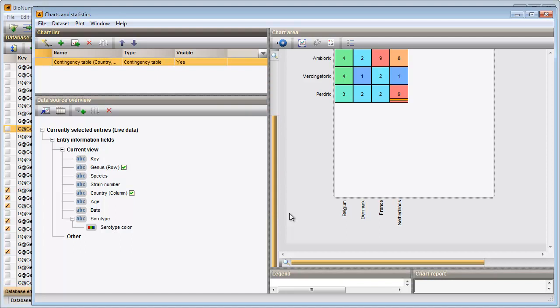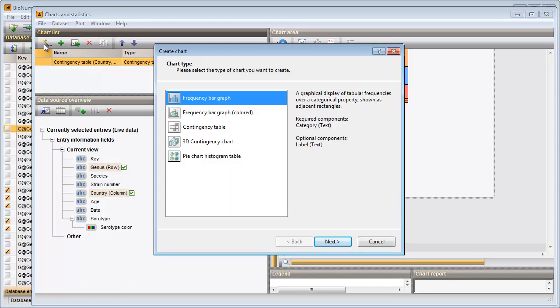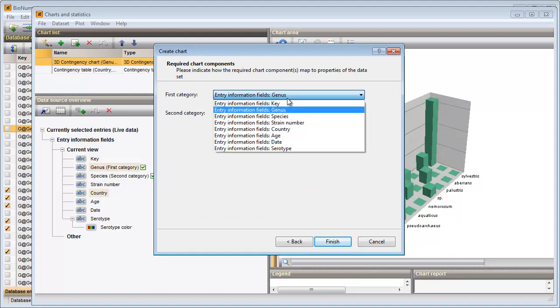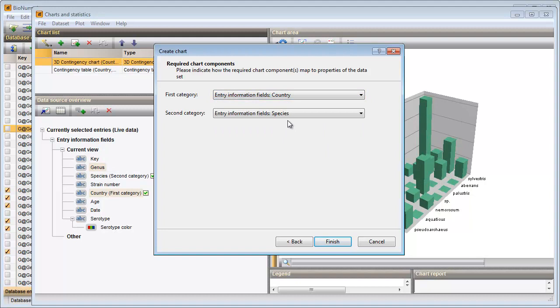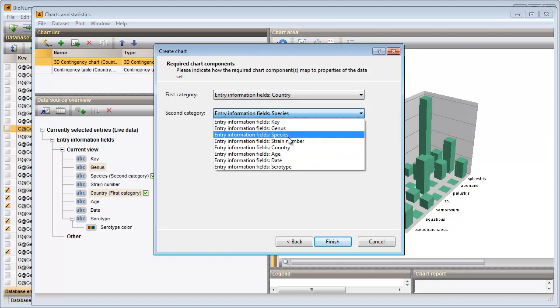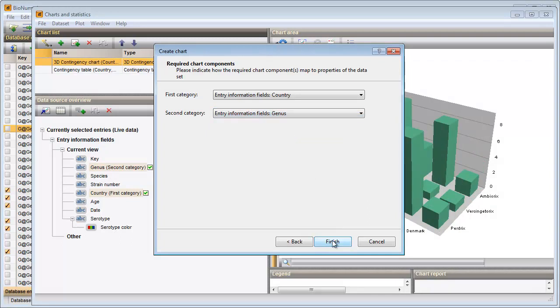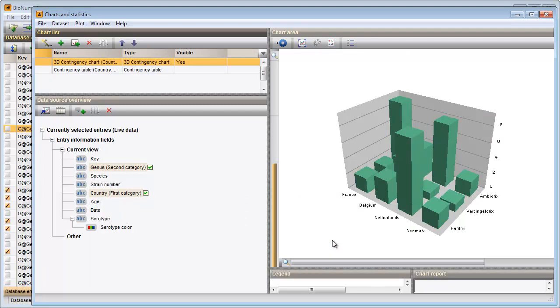To view the plotted data in 3D, I select my two groupings in the Data Source Overview panel and launch the Create Chart wizard again. I select '3D Contingency chart', select my categories again, and press Finish to plot the data. With the mouse I can rotate the image.